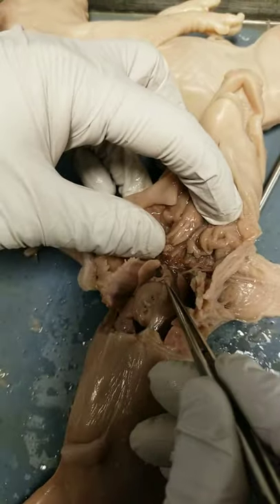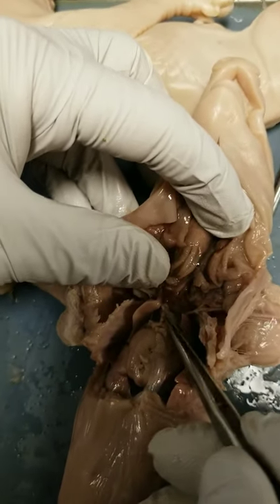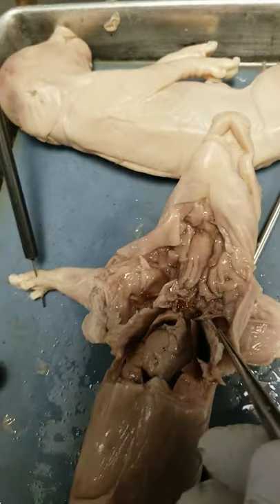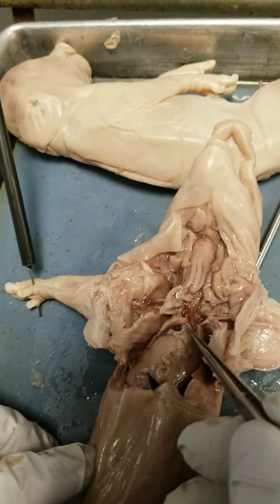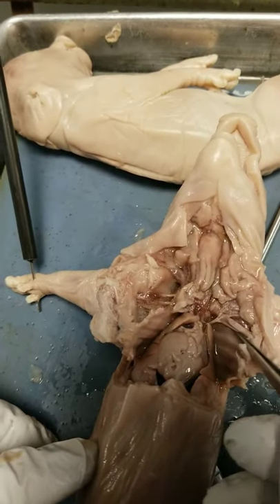Sitting on top of the heart you can find what looks like fatty tissue — that's an immune organ called the thymus. It's where T cells come from.